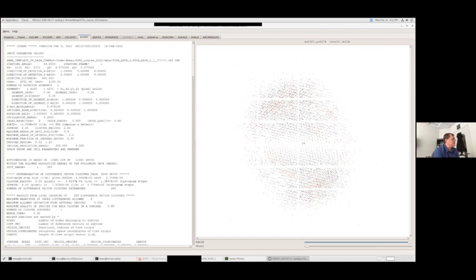Some of you guys would have seen that when you were doing data collection. We might have brought that point up that, oh, here you can see that there are multiple lattices. This would be another way of seeing that, because you would have a lot of spots that are indexed and in black, but you would also have maybe an equal or comparable number of red spots that are also interspersed on this image. So visually, that's something to look for in the IDXref step.